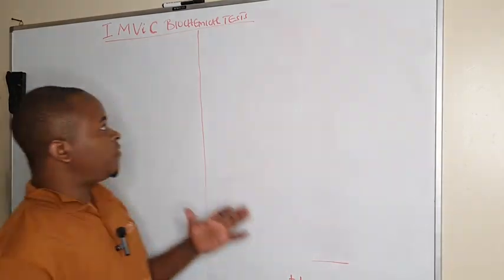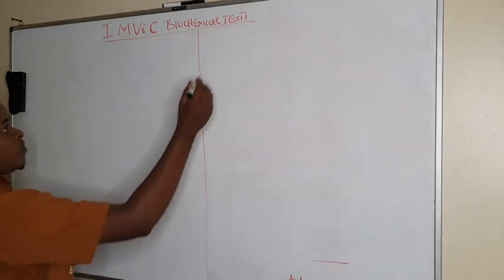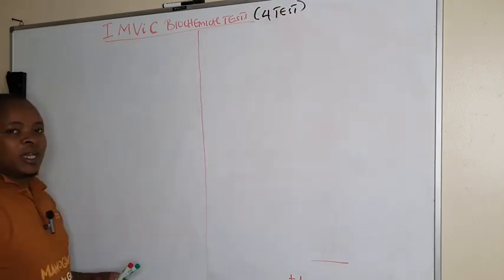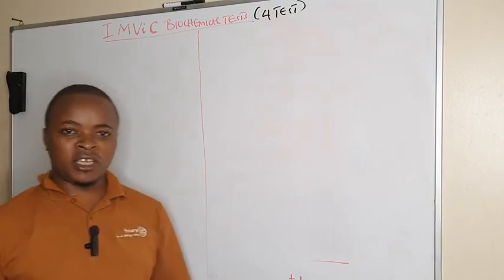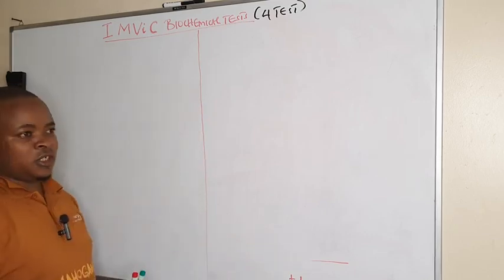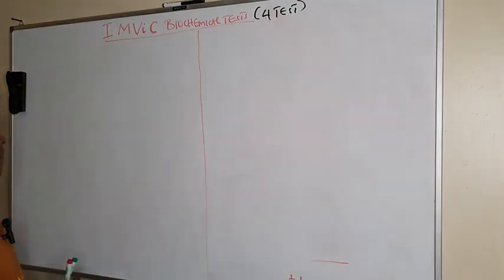So we want to see these 4 tests, which is a set of 4 tests. How are they utilized in identification of enterobacteriaceae or enteric bacilli?